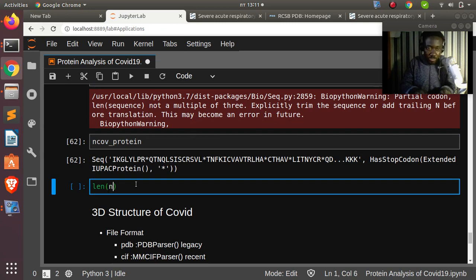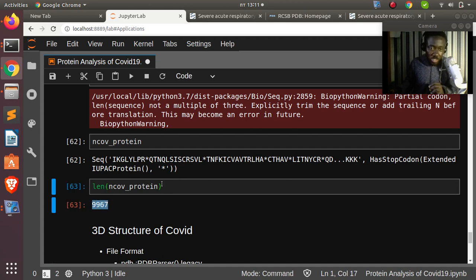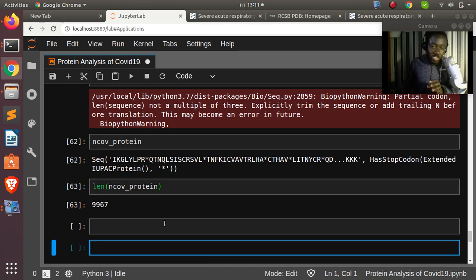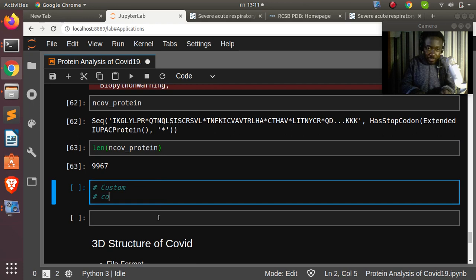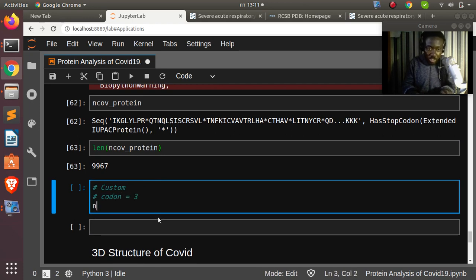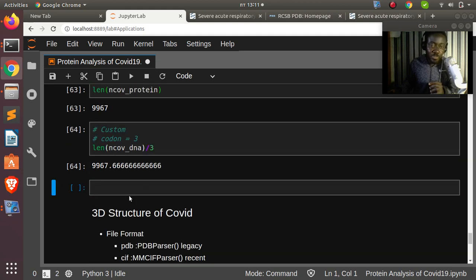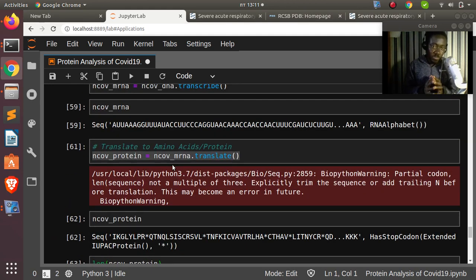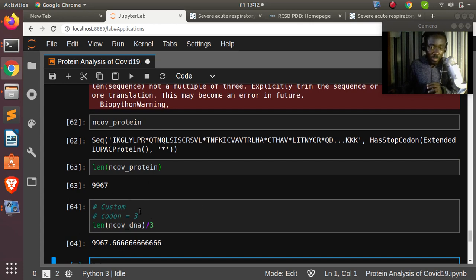Checking the length of the protein with len(ncov_protein) gives a very large number. As a quick verification, you can also calculate this as len(ncov_dna) / 3 since every codon is three nucleotides, and both methods give the same answer.